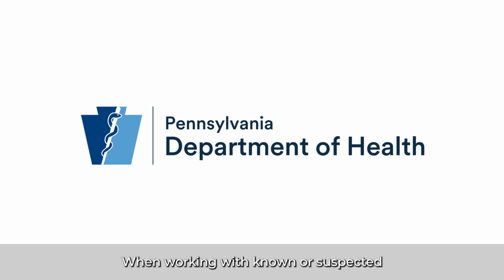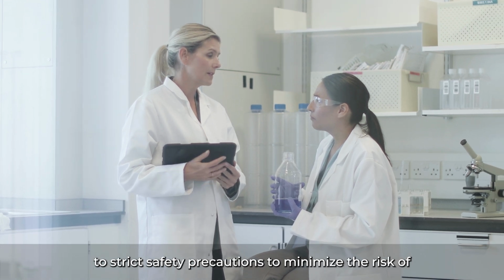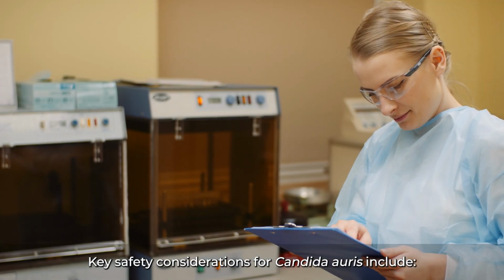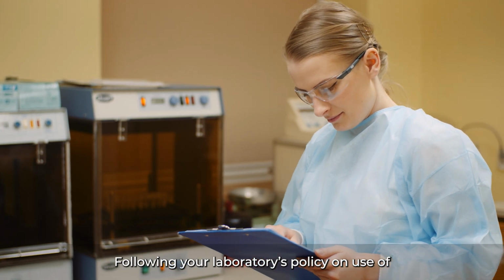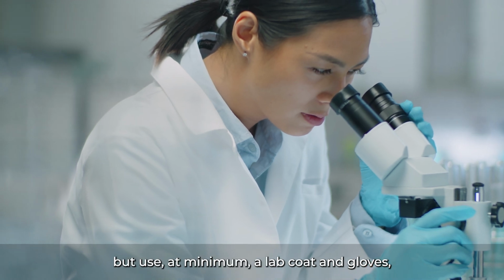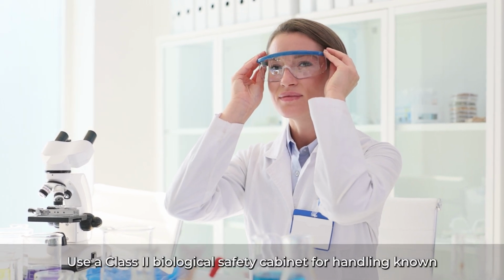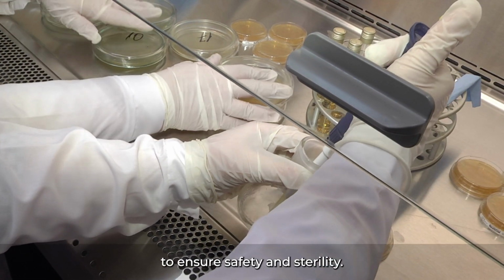When working with known or suspected Candida auris isolates, laboratory personnel should adhere to strict safety precautions to minimize the risk of exposure and contamination. Key safety considerations for Candida auris include following your laboratory's policy on use of personal protective equipment, or PPE, but use at minimum a lab coat and gloves and eye protection if splash may occur. Use a Class II biological safety cabinet for handling known or suspected Candida auris isolates to ensure safety and sterility.